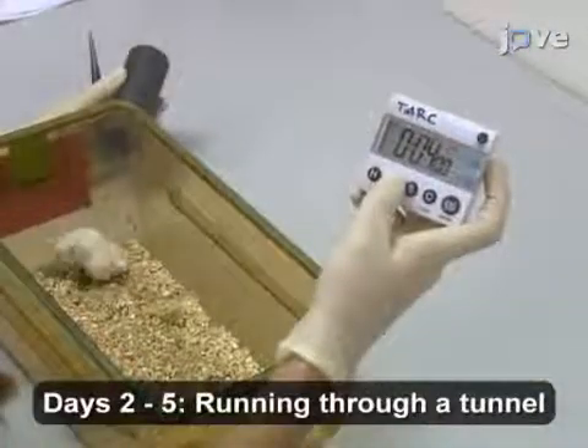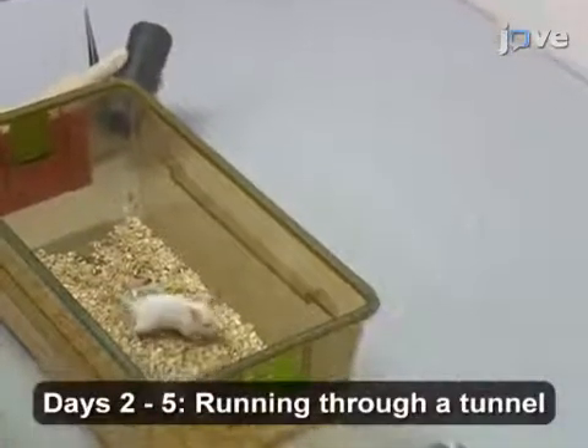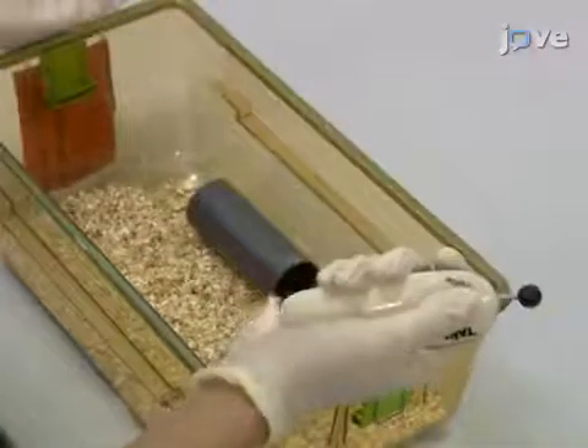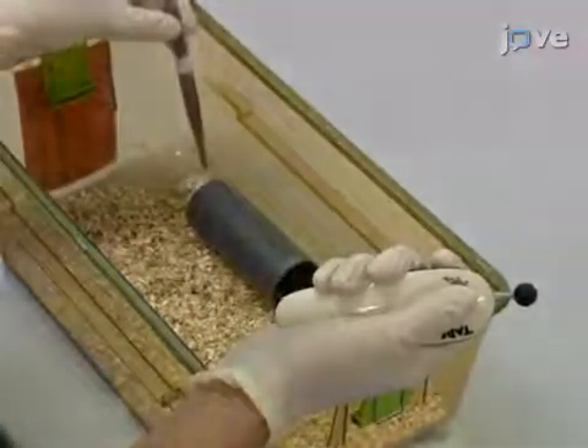On days 2 through 5, set the timer to 5 minutes. Press start and add the mouse tunnel to the home cage. As soon as the mouse enters the tunnel, click and present the reward at the end of the tunnel.